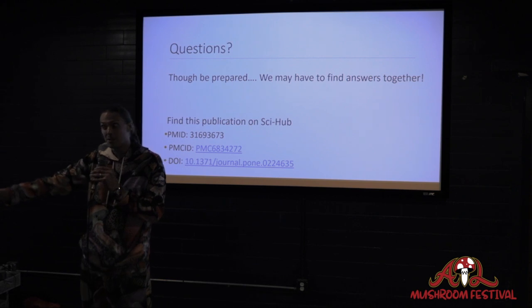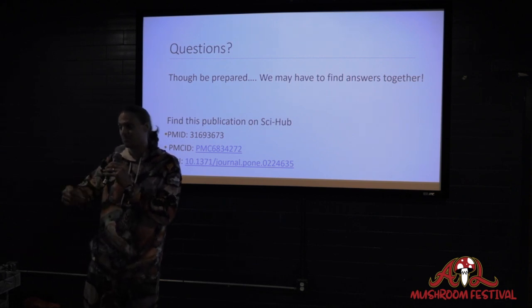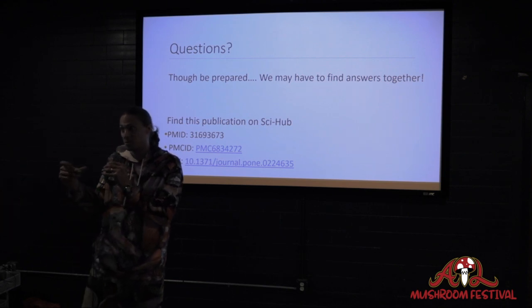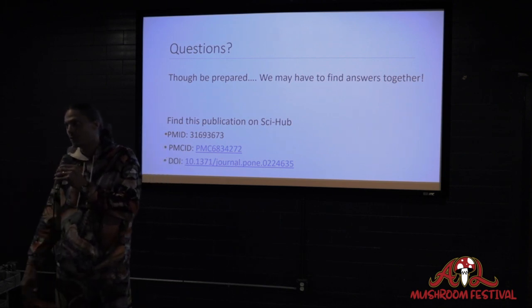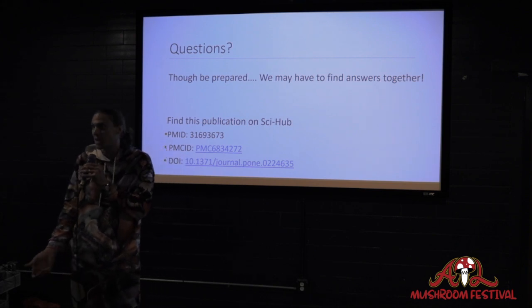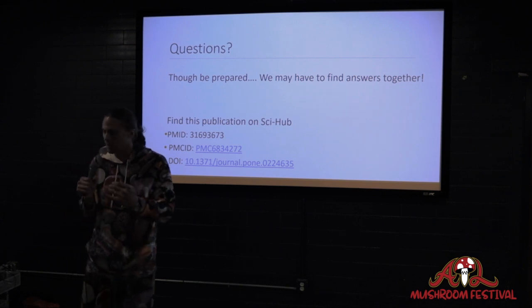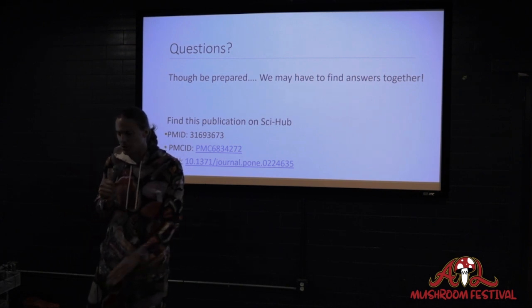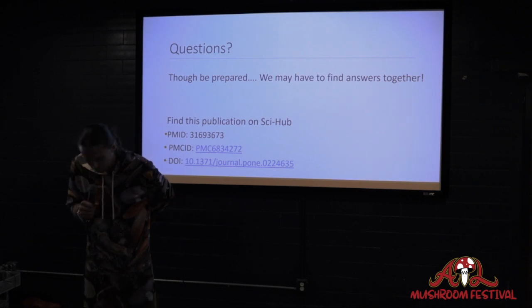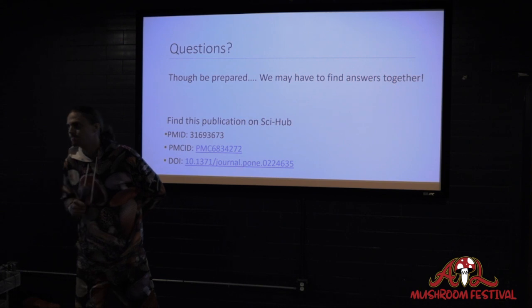But what does come out is almost guaranteed to be pretty darn clean, because it had to grow through. If you put like a 2-inch ledge on it, then it has to grow through 2 inches of material in order to reach that other side. But that may take 30 days as opposed to 7 to 10. So that's where you kind of have to just play around with it. I would go bigger rather than smaller, but it's effective either way. It is a function of time at that point.